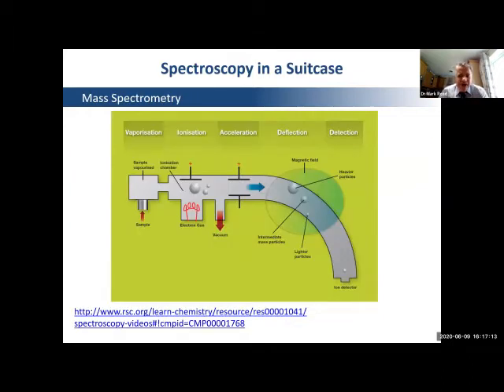Part of the workshop, as I mentioned, also looks at some other data to use. And I am going to make available the handout that we use. Part of the other data commonly used for compound identification is mass spectrometry as well. Now, I'm not going to go into the theory too much here. It also depends on the syllabus. I think some exam boards do the deflection of the ions through a magnetic field, and some do the more modern technique of time of flight.